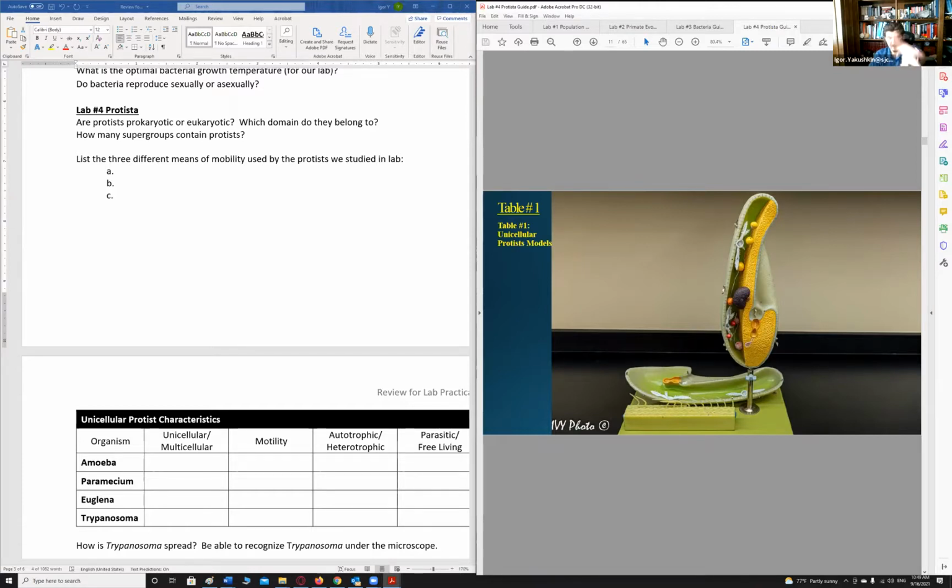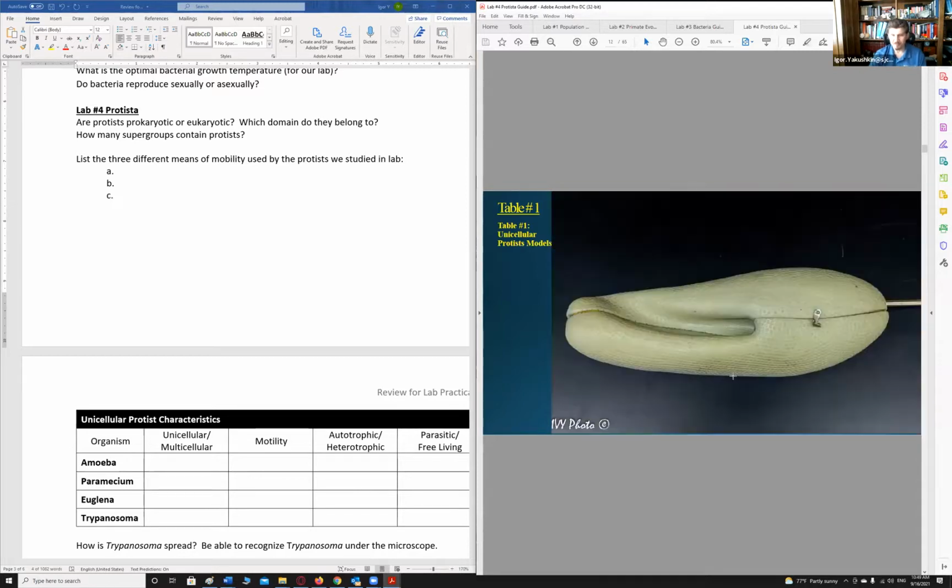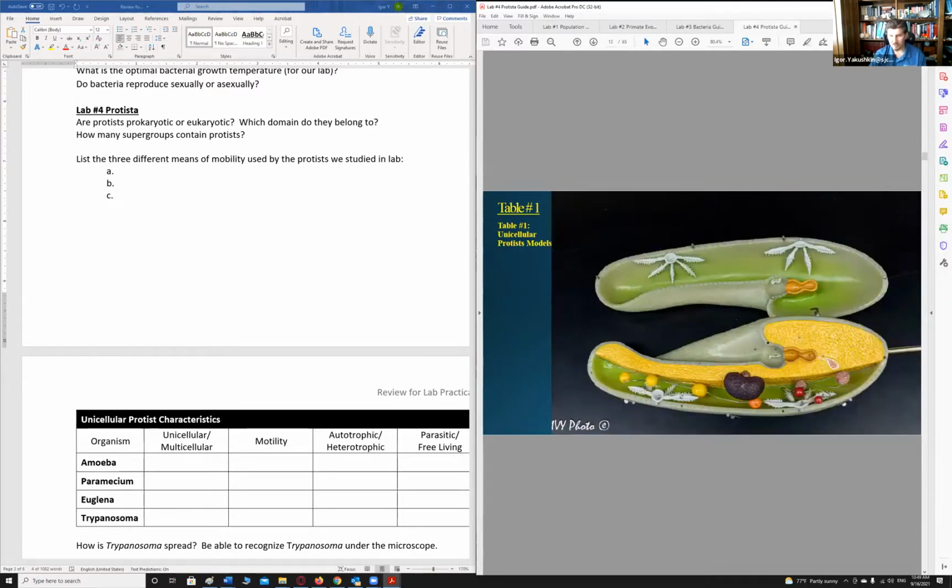fast, and because they are moving into the environment, exchanging the substances with the environment, they require 2 contractile vacuoles. So we have 2 of those particular star-looking shapes. So this is how it closed, and now we're looking at the open one. This is the contractile vacuole channels, and the contractile vacuole will increase and then expel excess water. And we're looking at the large macronuclei, and the small one is right here.